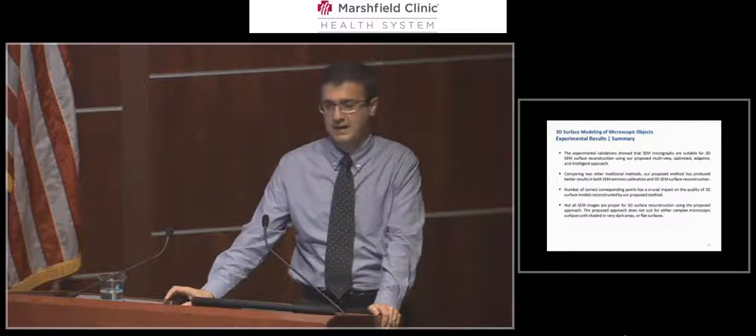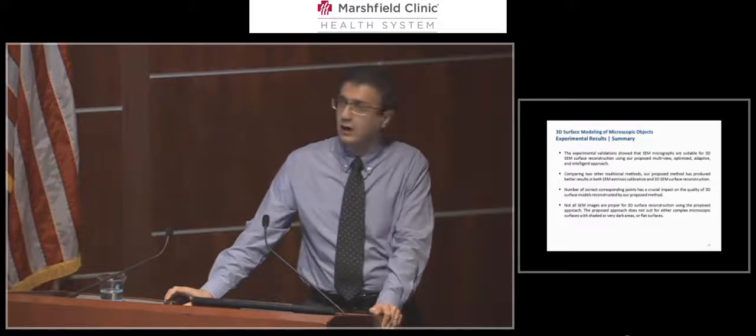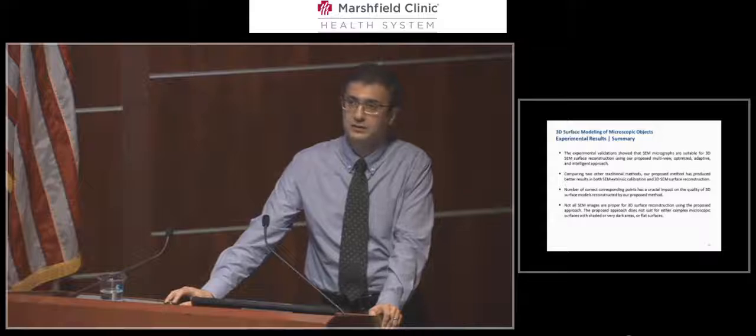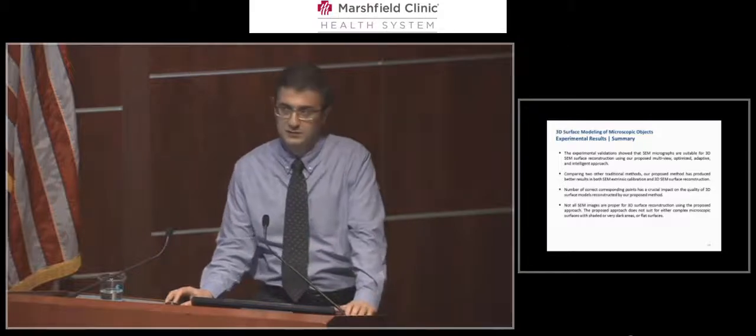The number of correct matching points has a crucial impact on the quality of the 3D surface model. Not all images, as you saw in the previous slide, are appropriate for 3D reconstruction. Flat surfaces, very complex surfaces, and dark and shadowed surfaces are not appropriate for 3D surface reconstruction using such an algorithm.